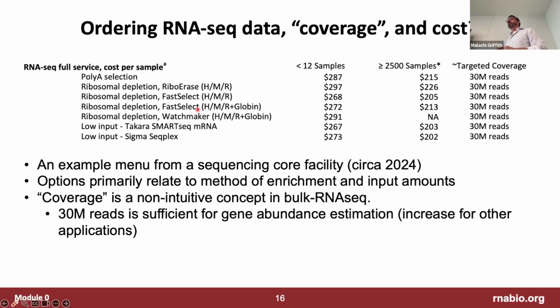So the question is, do you need more replicates for RNA-seq versus DNA-seq? That is a really interesting question as well. I think the answer is yes, although it probably depends exactly what you're doing. For a lot of samples, the genome in the sample is more of a fixed quantity, and the transcriptome is more dynamic.